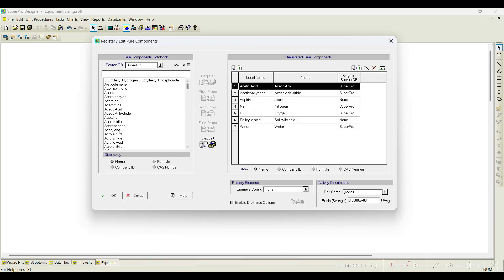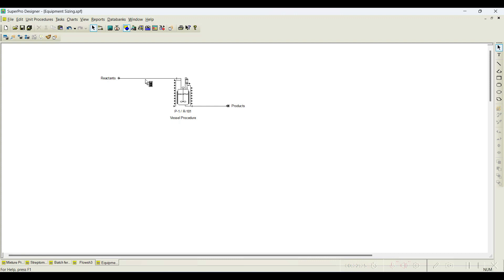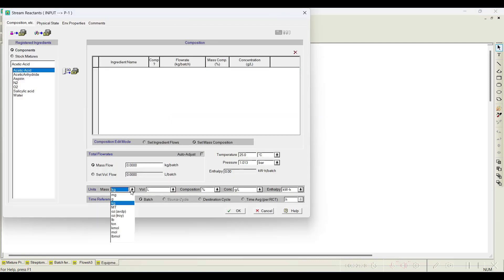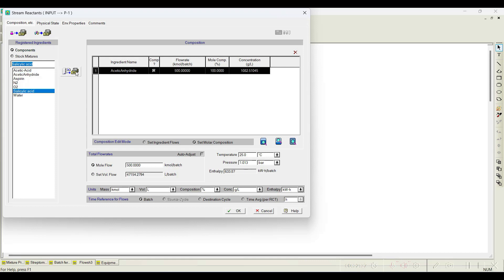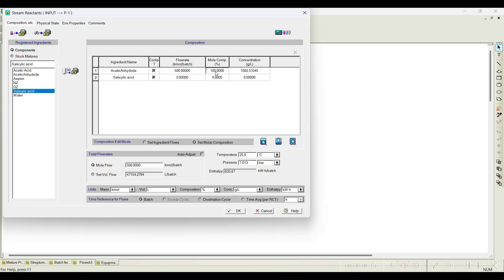Acetic acid and acetic anhydride are already available in the database. Aspirin and salicylic acid are not available, so we need to register them as pure components and add all the required details. I will assume around 500 kilomoles per batch is flowing — the ingredients are acetic anhydride and salicylic acid, each at 50 mole percent.